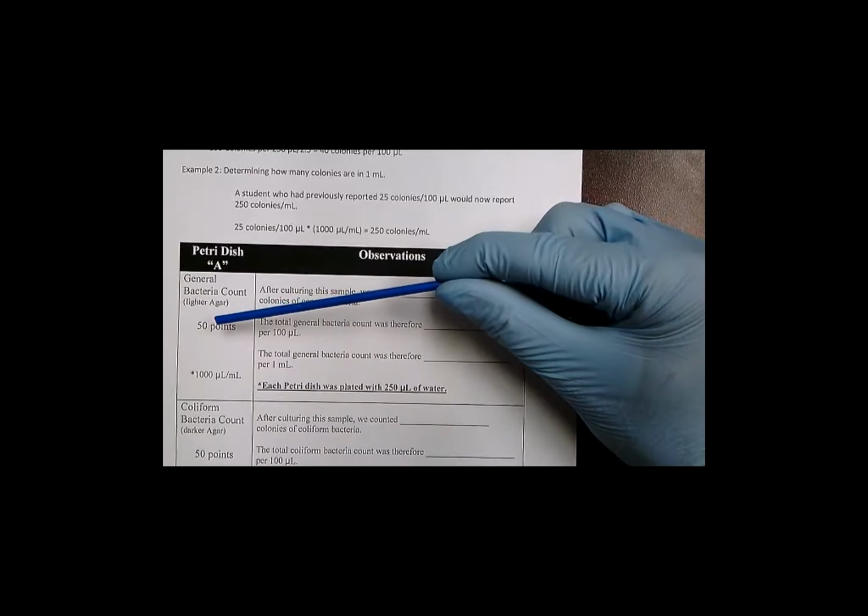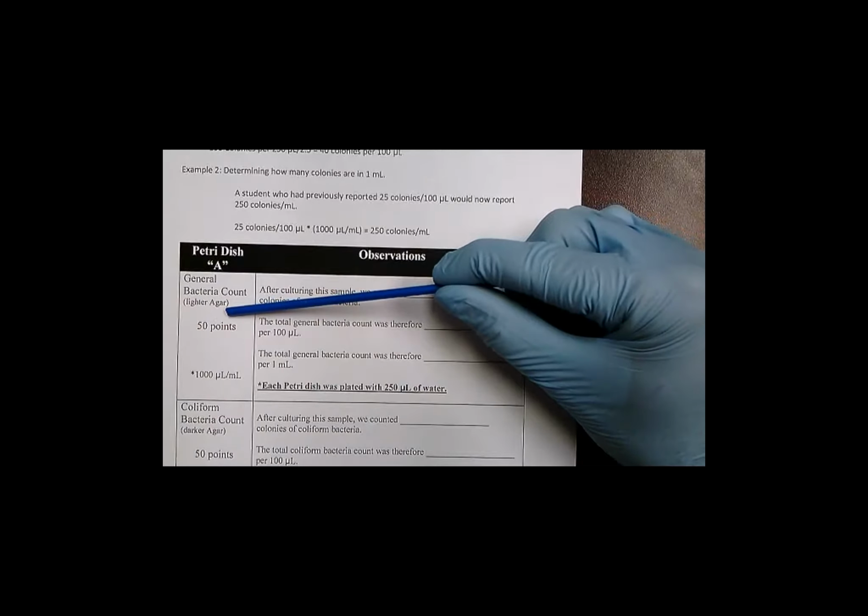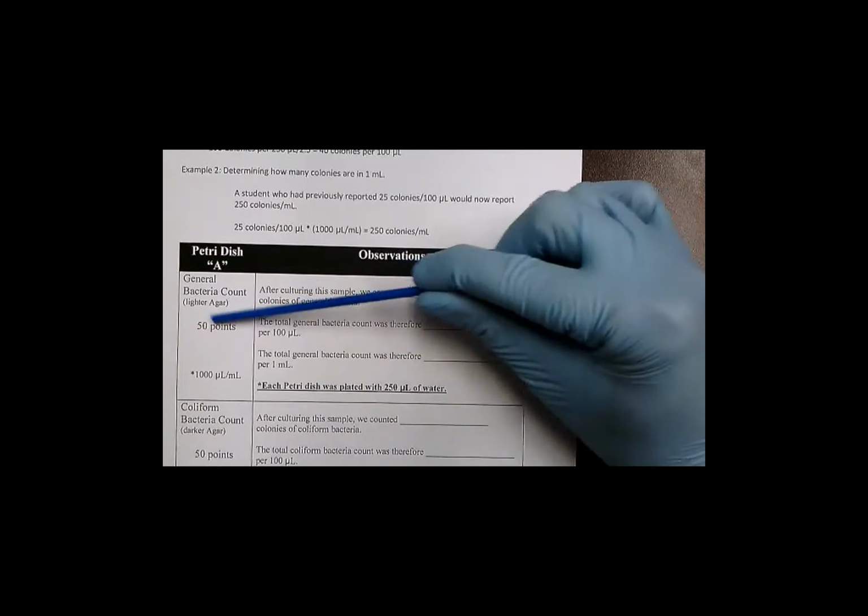So there's an observation form, and there's a Petri dish A, which here says general bacteria count, lighter agar, so that's the nutrient agar. That's the dish where the students are looking for general bacteria. So they're counting every single colony on that agar dish. And it says it's 50 points.